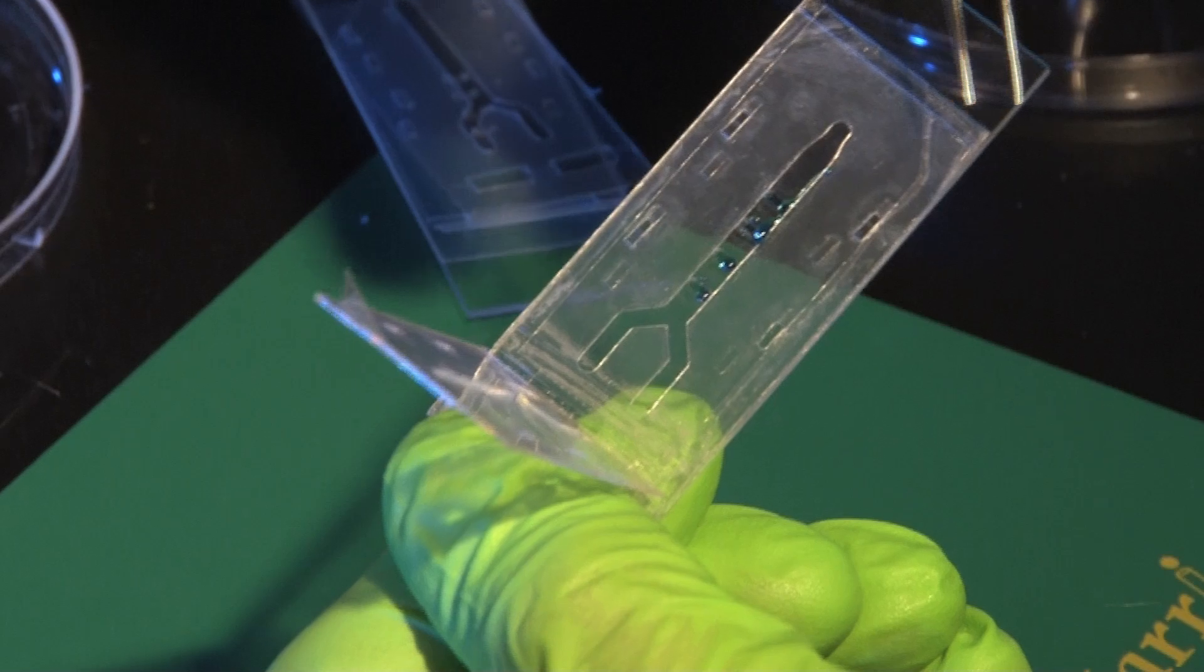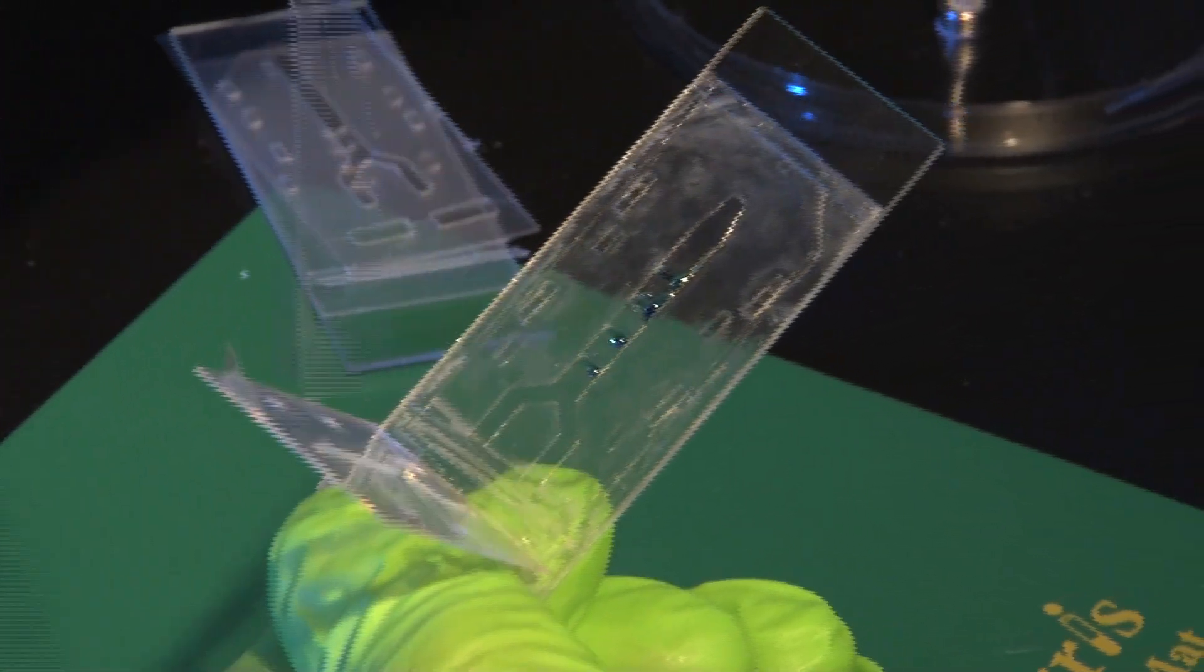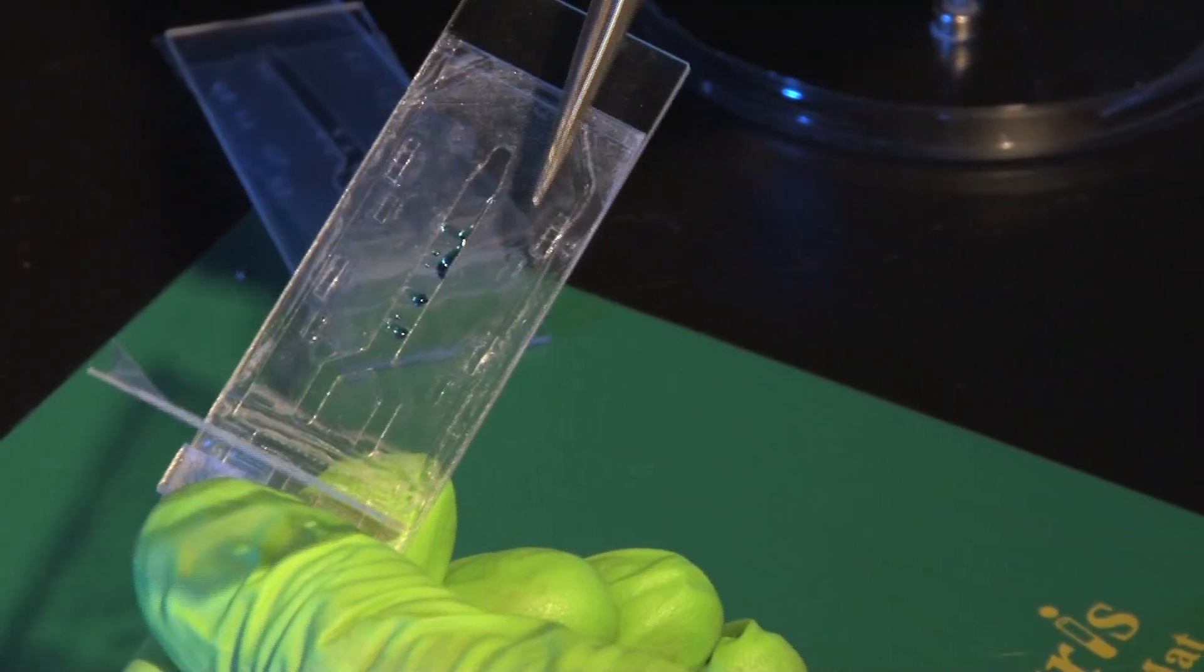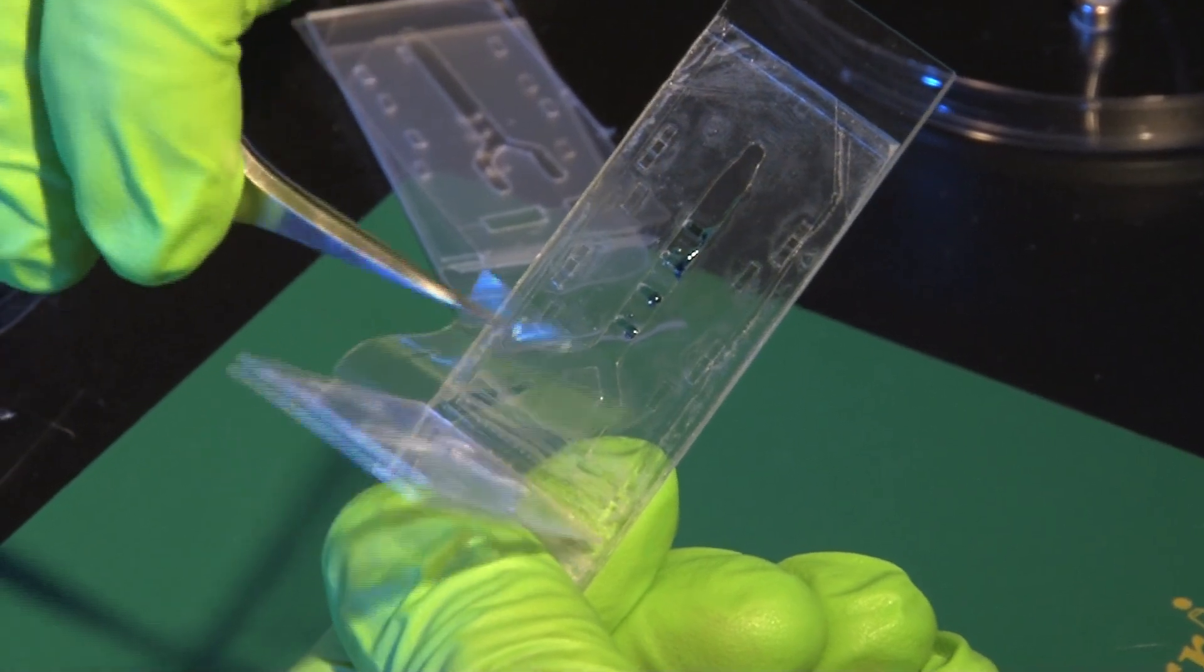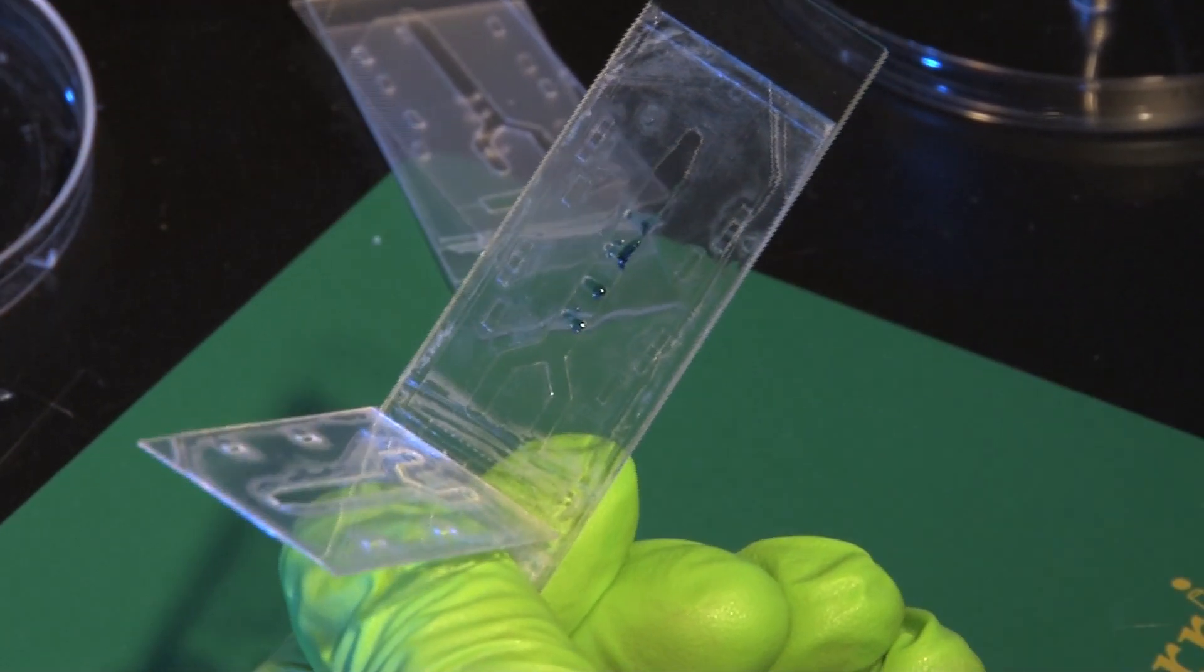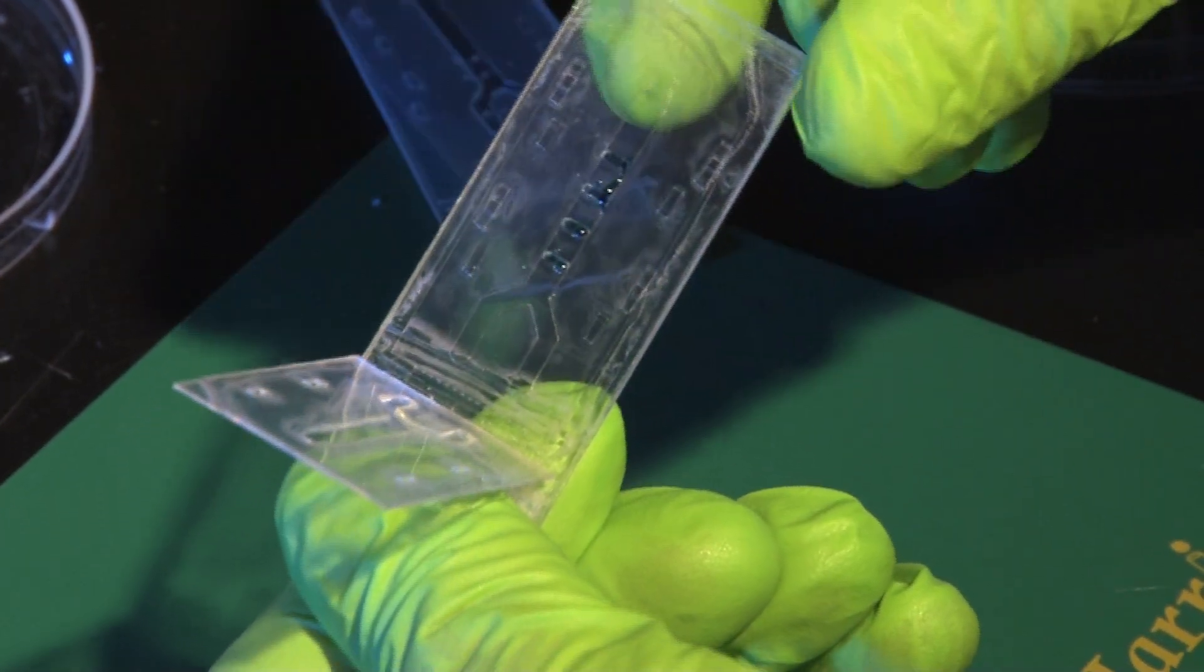At this point I take this liner out and then it exposes here this sticky double sided tape. I do the same on the lid. I just take the liner out and now I'm going to close it.